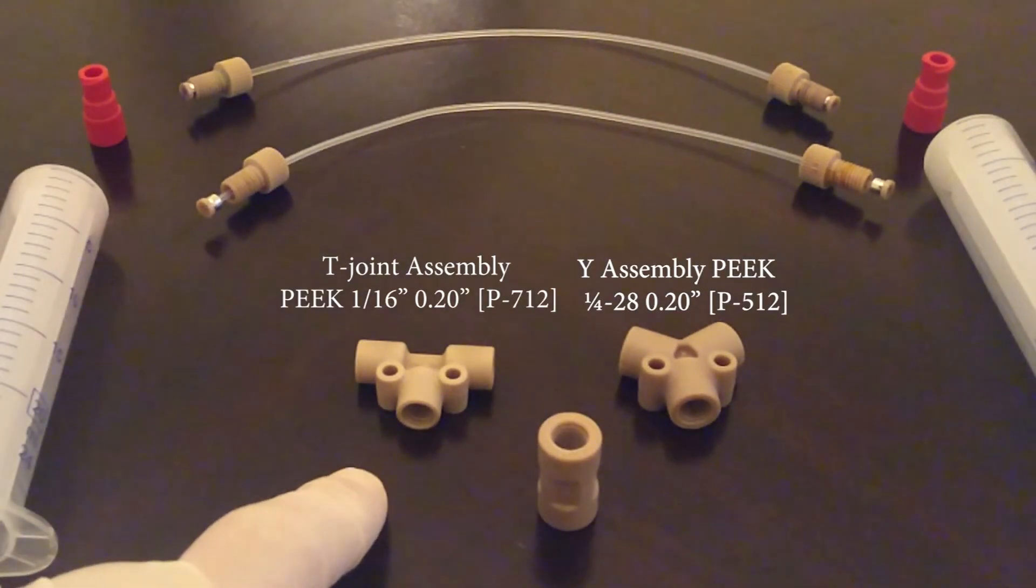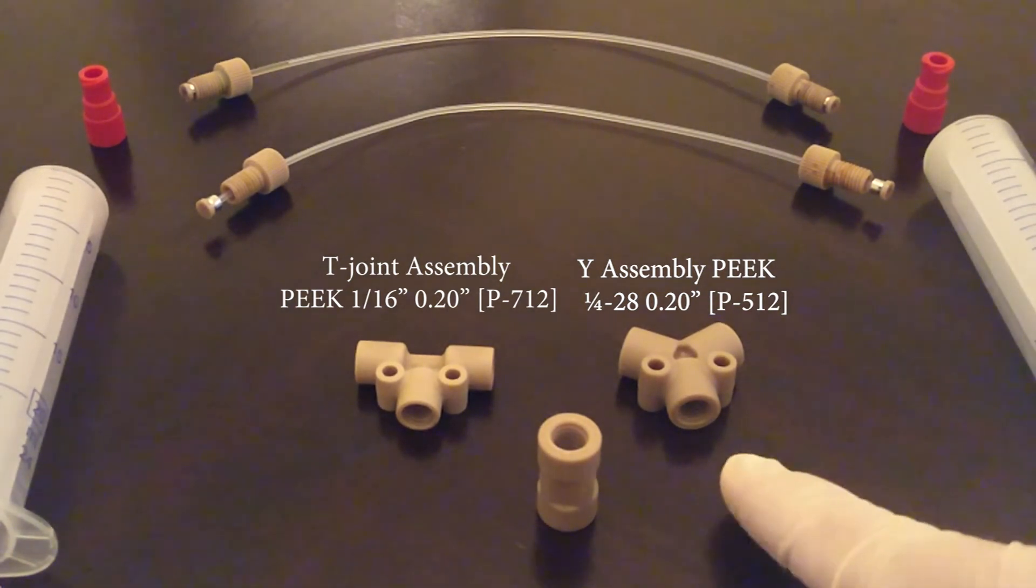To have efficient mixing, use a T-joint. If you want two solutions to flow next to one another but not mix as quickly, use a Y-joint.